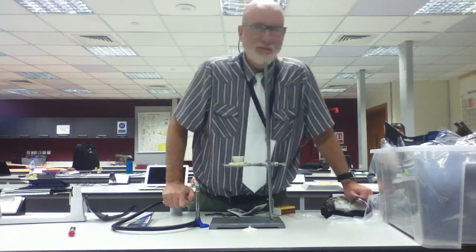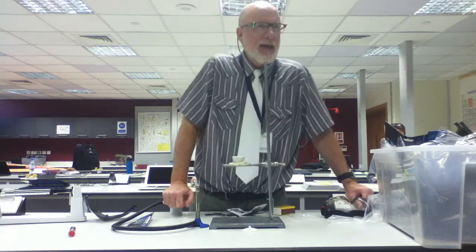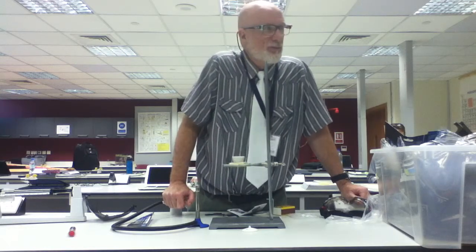Tell the teacher, thank you for labeling it as acid, true or false? Yeah, you would do that. Because what would happen if you saw an Erlenmeyer flask and it wasn't labeled? Would you say to yourself, that's very interesting, let me taste that to see what it is? Would you do that? Okay, remember I said to be serious. I'll give you detention until you're 50. Understood? Good.